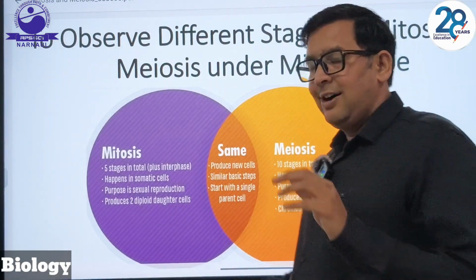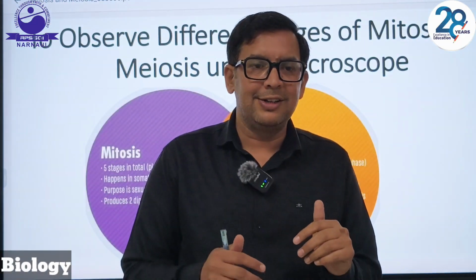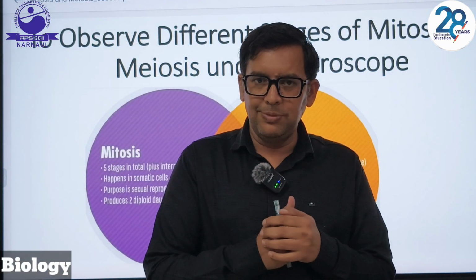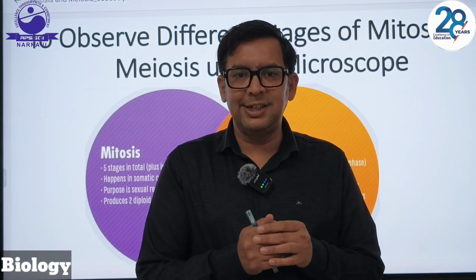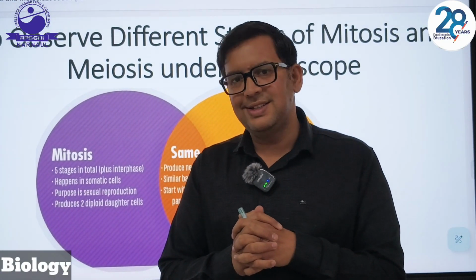Students, I know it is a little bit difficult to observe under the microscope, but with the help of the teacher and with keen observation, you will be able to understand these steps.